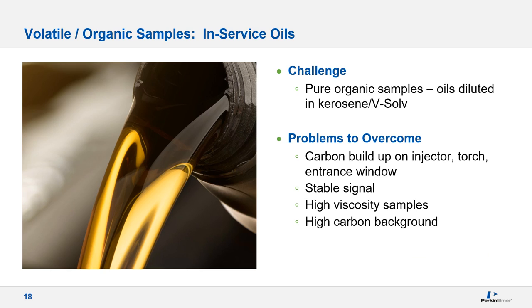The challenge is that these are pure organic samples. The oils are diluted in kerosene or VSOL for analysis. The problems to overcome are carbon buildup on the injector, torch, and spectrometer entrance window, maintaining a stable signal, the high viscosity of the samples, and the high carbon background. Let's look at how each of these challenges are addressed.